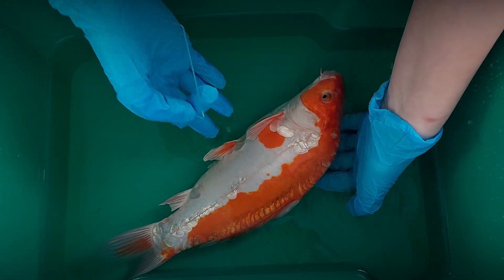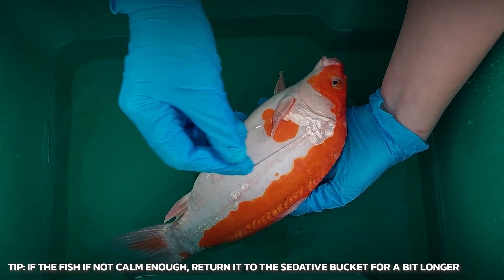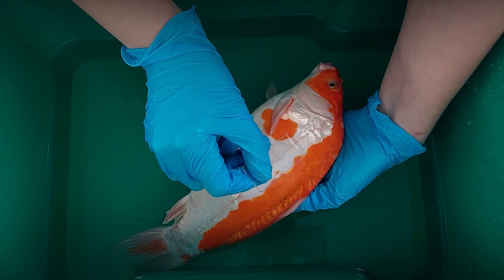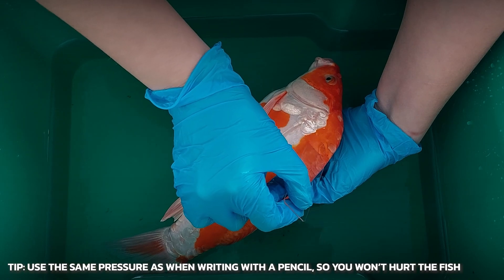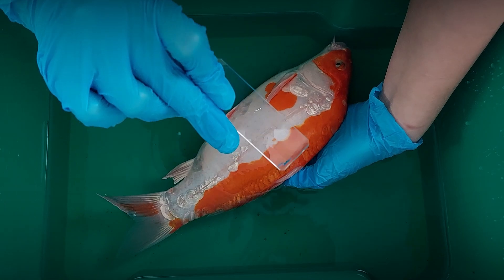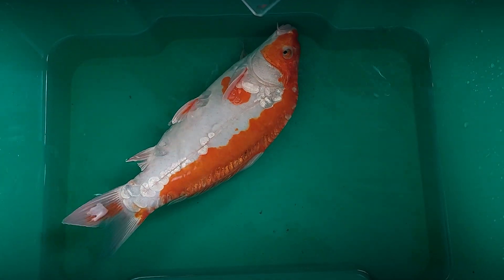Carefully take the fish out and position it so that you can scrape it in the direction from head to tail. Hold the slide at a 45 degree angle and gently, without pressing hard, scrape along the lateral line and then along the base of the dorsal fin. A sample of slime and perhaps a few scales will be left on the glass.